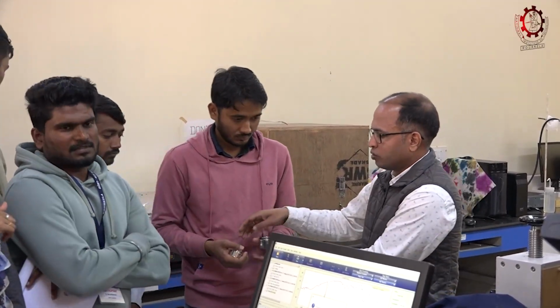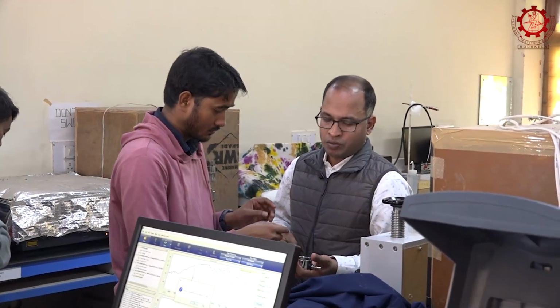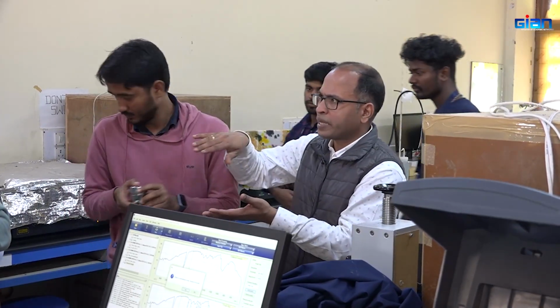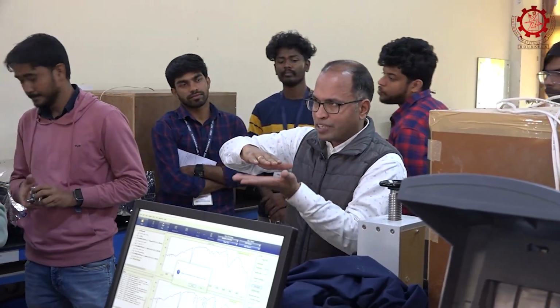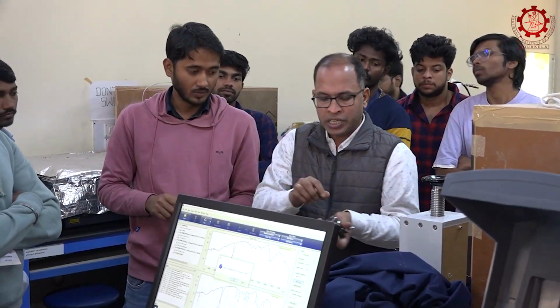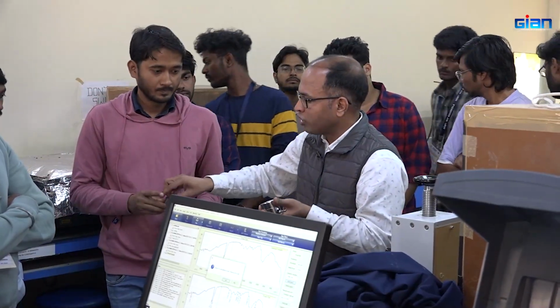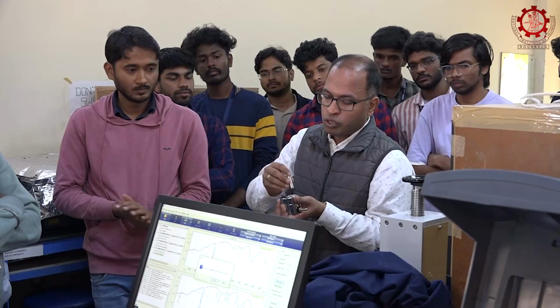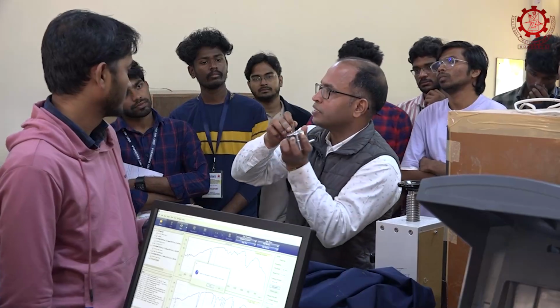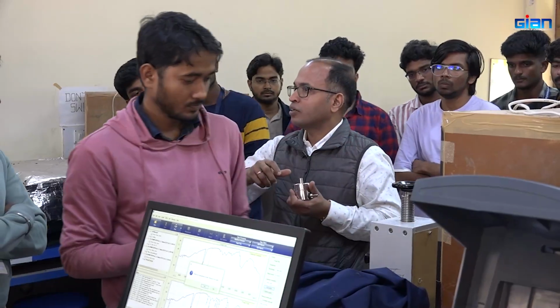So here, okay. So now you see, yeah. All these techniques. So what we do, we make the place ready. For example, here, yes. So now here we put our compound, that solid mixture. Okay. So when we put our solid mixture, then to make the film, we put this one. Okay. So now between this and this, there will be the solid mixture. Okay. So now we put it in there and give pressure.